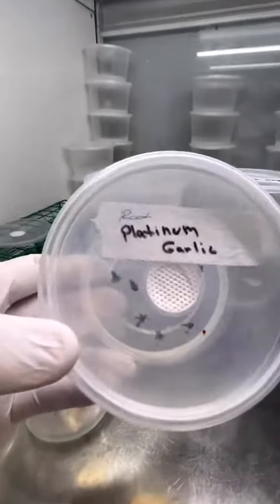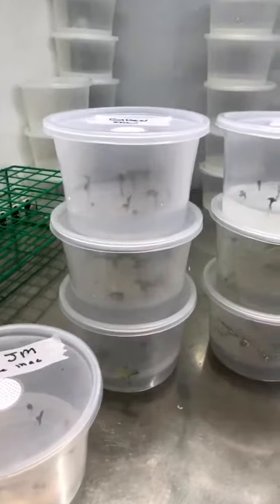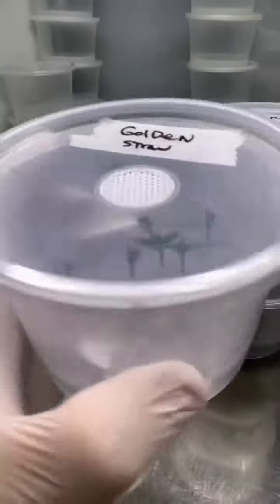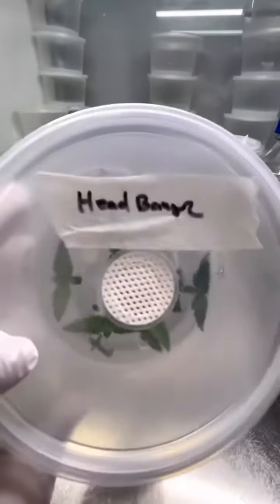I truly love this practice — it's made all the difference in the world. I mainly use it for older seeds, but now we're using it for most of our seeds because it's convenient and sterile. I've found that most of anything that comes out of the culture, because of the hormones, they're much smaller and more compact. Efficiency, greater room, etc. This method has proven very successful for us.